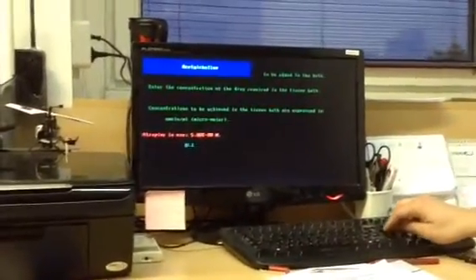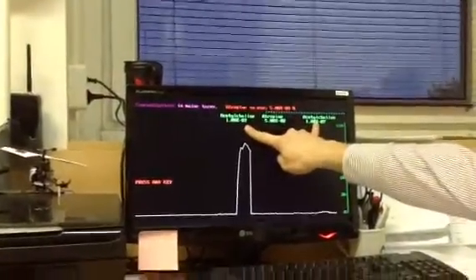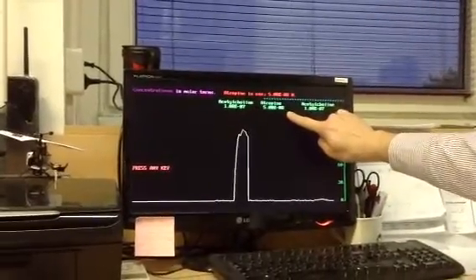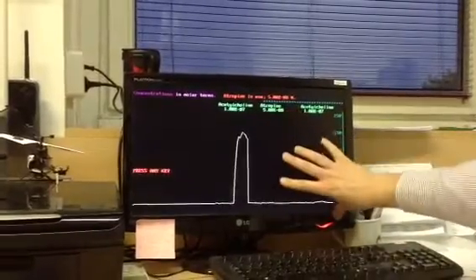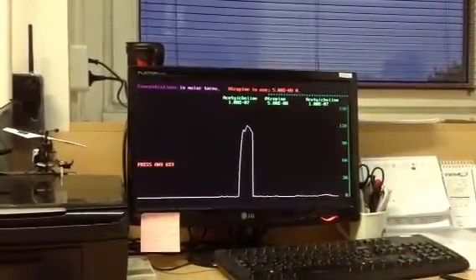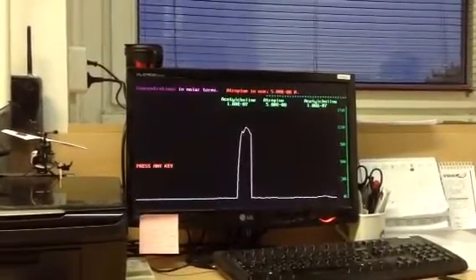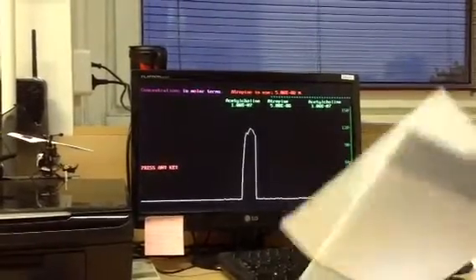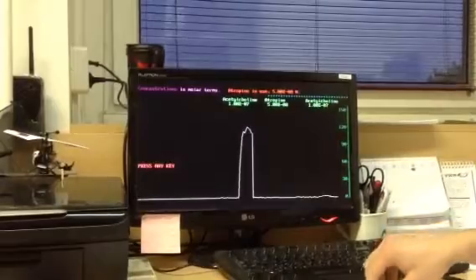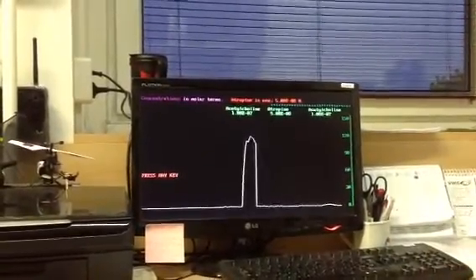Why? Because in this case, the acetylcholine was used in the same concentration, 0.1, but in the presence of atropine, and it completely blocked this effect. So it's a really nice demonstration that acetylcholine's effect was mediated through muscarinic receptors. Okay? It's the first part. It's really easy. You just have to remember these numbers. Shall I write it or do something? Or I think you have the video.